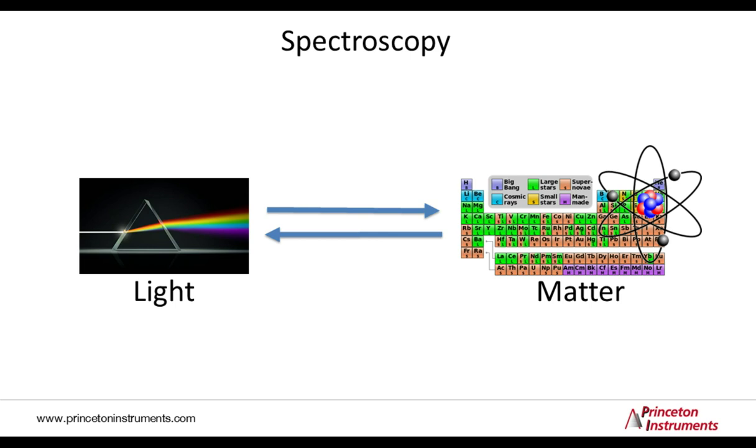Recently, we started a series of webinars illuminating the fundamentals of spectroscopy, that is, interactions of light and matter. So today we will continue the series by talking about Raman spectroscopy.